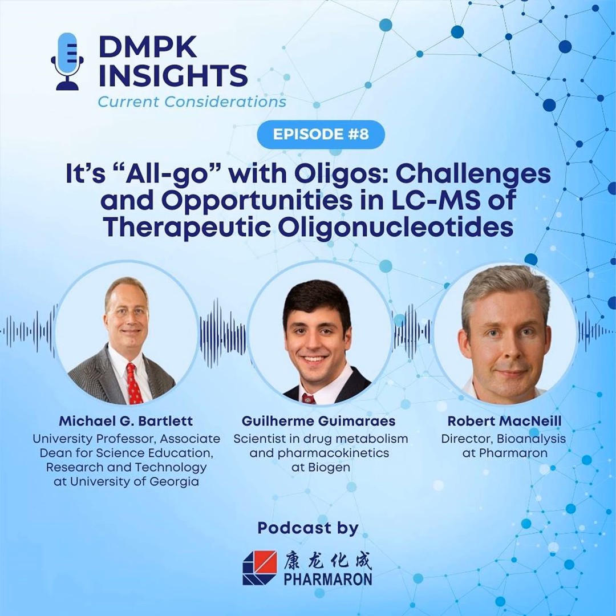I mean, I think the issue with ammonium acetate was just it didn't interface with mass spectrometry as well as people had hoped for. The retention was okay, but still not as great as you'd hope for as well. So there were multiple problems with it, and so the ion pairing helped a lot more with the retention and the separation of it. But again, the mass spec sensitivity was still fairly poor as well. Though the ion pairing acetate separations themselves with a UV detector are actually pretty solid. So that part of it wasn't a big issue. It was the move to wanting to use mass spectrometry so that you could figure out more of what you were looking at than what you got with just using a UV detector.